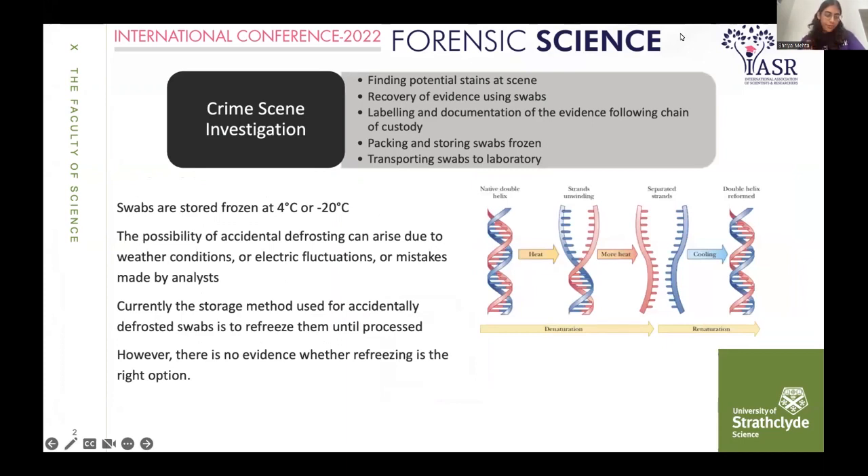In a forensic investigation, there's a standard procedure following the recovery of swabs, which involves finding a potential stain at the scene, recovering that evidence using a swab, labeling and documenting it, following all the rules, and then packaging and storing it frozen. According to standard protocols, all swabs should be stored at 4 degrees or minus 20 degrees Celsius.